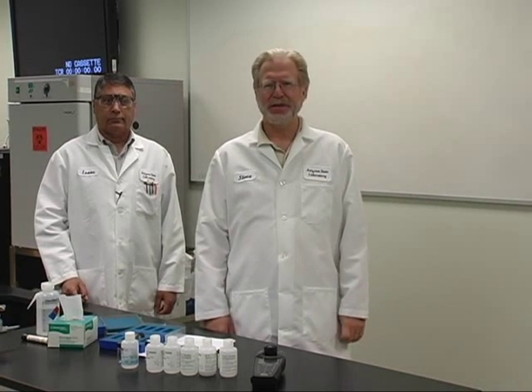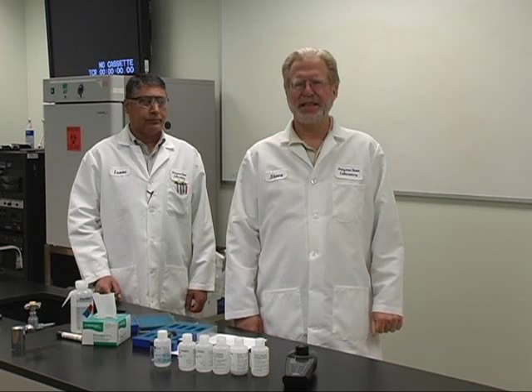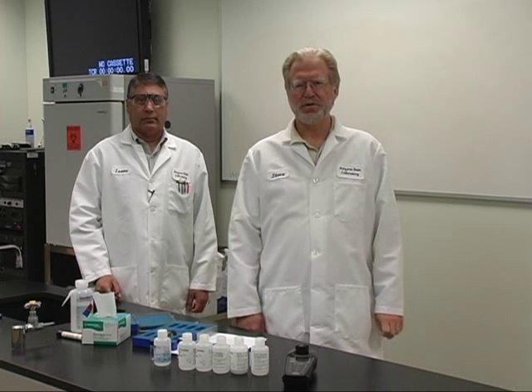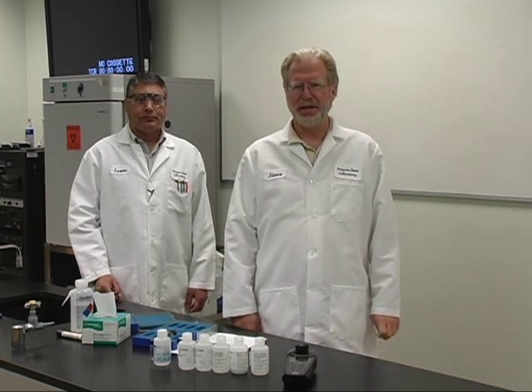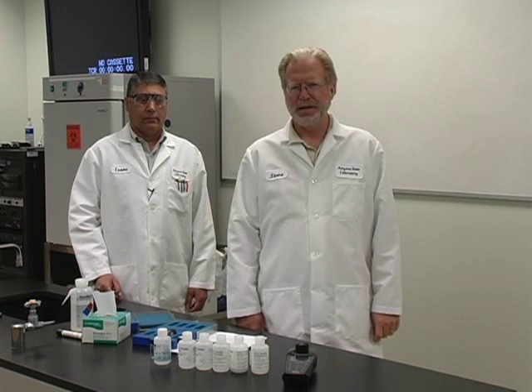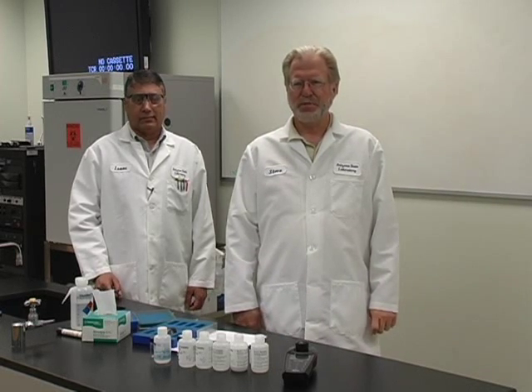However, if your inline meter cannot be calibrated, then as stated in standard methods, it must be backed up by an in-lab meter. Also, some facilities' permits before 2009 had turbidity for monitoring which could require a lab meter. I am here today with Isaac Robert to have him demonstrate for us the in-lab turbidometer.